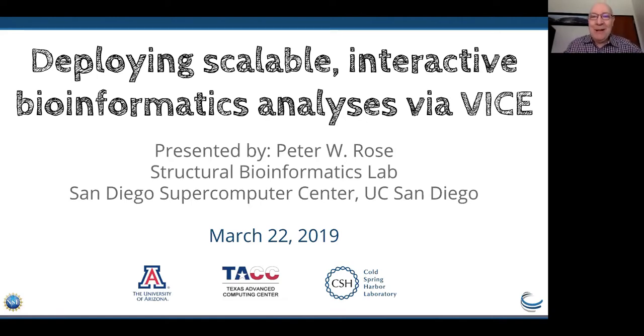I really appreciate the opportunity for us to present our latest work. As you probably know, CyVerse has a new feature called VICE, their Visual Interactive Computing Environment. It allows you to run basically web-type applications like Jupyter Hub, RStudio, or Shiny applications within VICE. Today I'm going to show an example of how we use that for 3D structure analysis. And I think this is the first time that a 3D structural analysis is run in CyVerse and in the VICE environment.